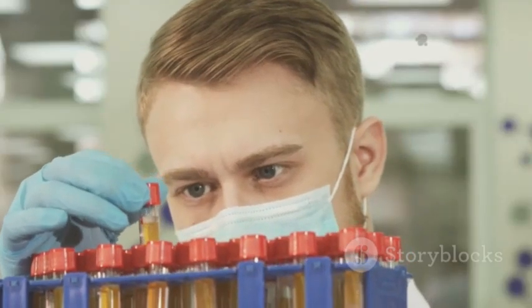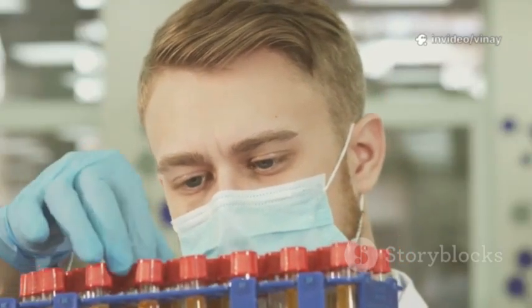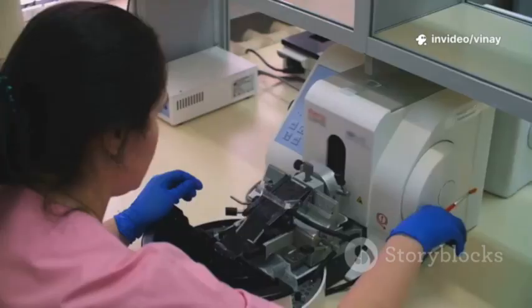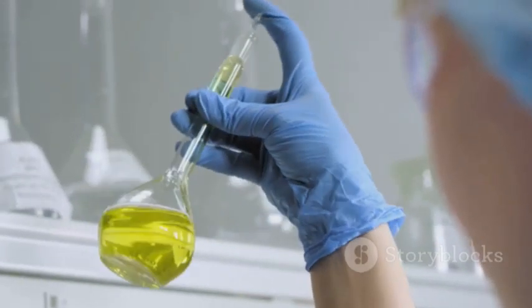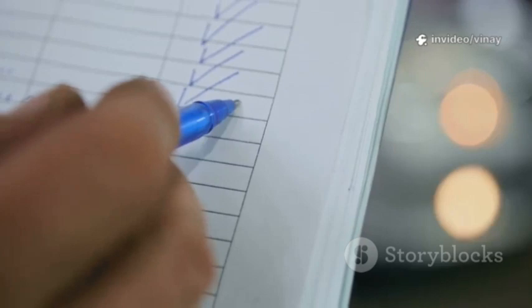Sometimes incomplete wetting can lead to a false failure because air pockets can allow gas to flow through easily. We also check the equipment. Is the pressure gauge calibrated? Are all the hoses and connections tight? A leak in the testing apparatus can mimic a failed filter. It's essential to rule out these external factors before concluding that the filter itself is the problem.